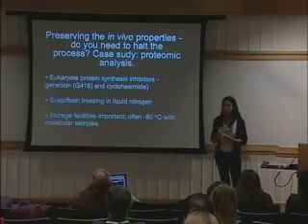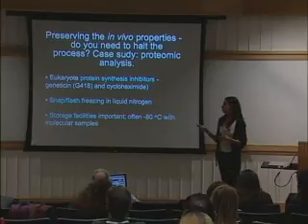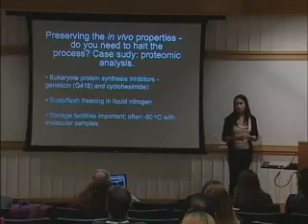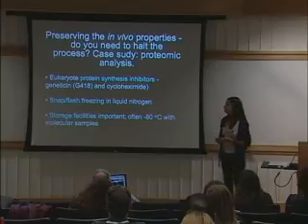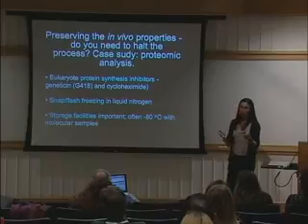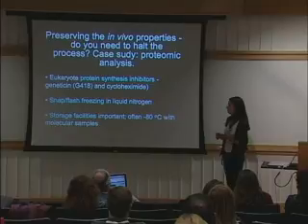But these protocols don't work for all cells, so this is something you can do with some species but not with others. And if you cannot interrupt protein synthesis by using these compounds, for example, you have to think about how you can work really fast to have a realistic representation of what went on at the time of sampling, rather than these weird heat shock proteins that you are getting because it took you a long time to centrifuge, to spin down the cells.